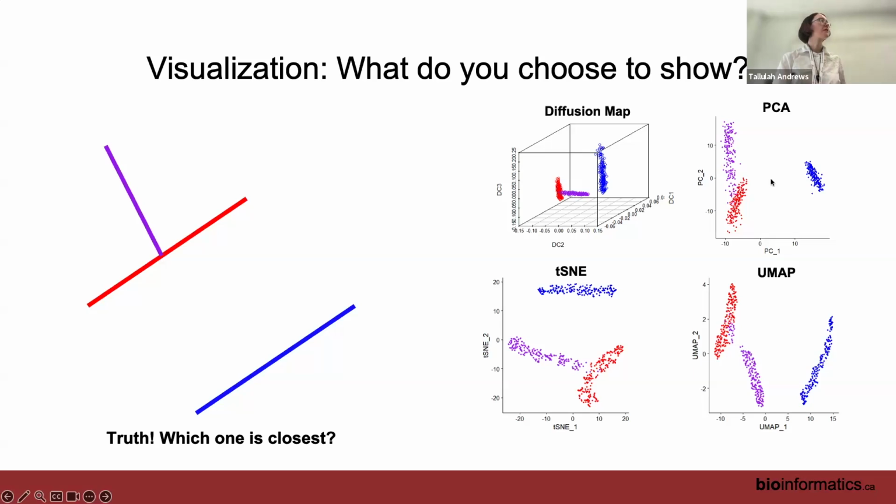We've got votes for diffusion maps on Edmonton's side. Ottawa, we've got one vote for t-SNE being most accurate. And I'm voting for UMAP. Depends on your goal, I guess. Yeah, it's hard, right? They're all kind of capturing it, but also they're all kind of wrong. A few more votes for UMAP.